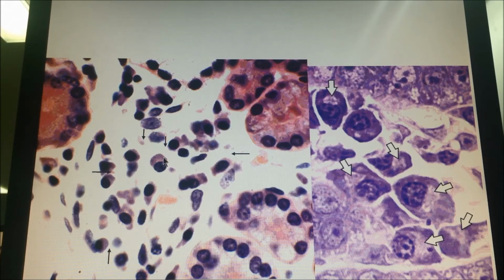We are telling you here that it produces antibodies, meaning there was time to recognize the foreign body and to form a memory about it to start producing antibodies. A large amount of plasma cells usually indicates a chronic infection, mainly a viral infection. Viral. The antibodies are mainly directed toward viruses.